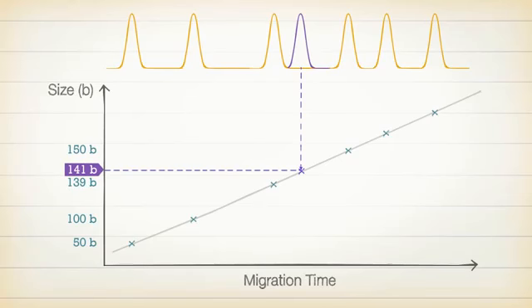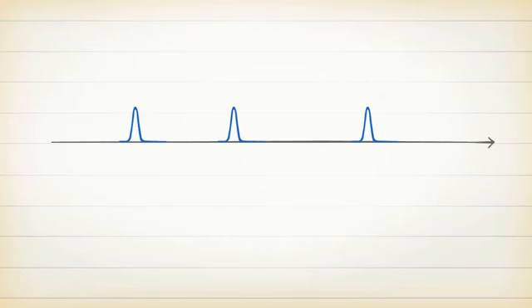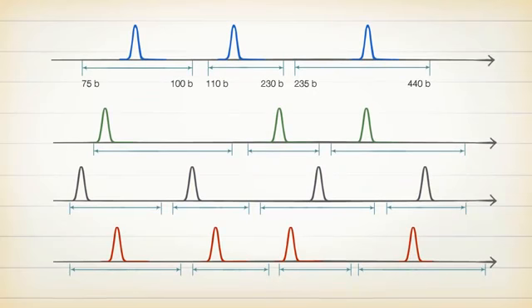One really big advantage in using your genetic analyzer for fragment analysis is the ability to multiplex. When you want to analyze DNA fragments in different size ranges, those fragments can be labeled with the same dye, separated in the capillary, and detected individually with no problem. However, when fragment size ranges overlap totally or even partially, you could not identify which peak corresponded to which fragment. This is where fluorescent multiplexing comes in.